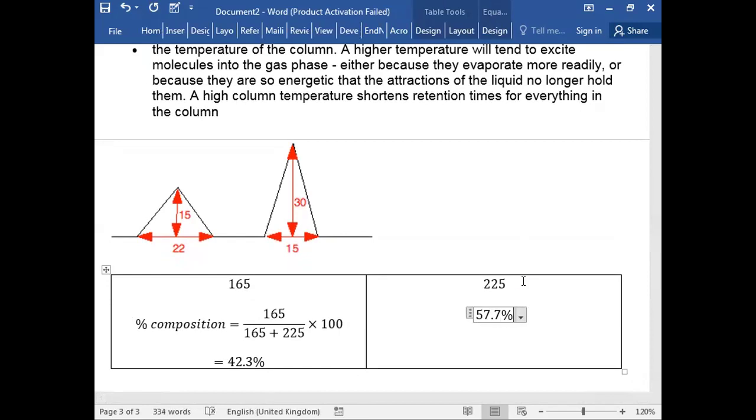So gas chromatography tells you two things. एक तो what component is present and how much of that component is present. On the other hand, thin layer chromatography only tells you what particular component is present. ऐसा ही है. Is this clear?